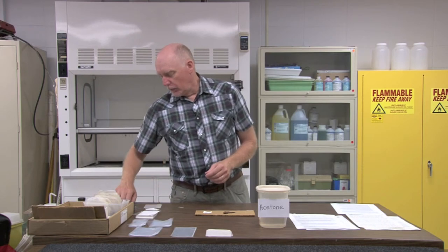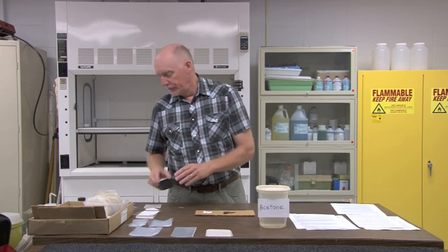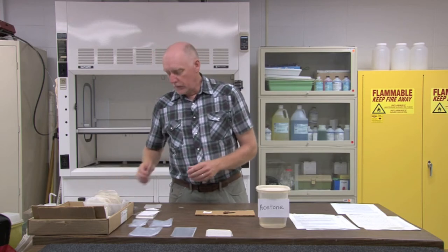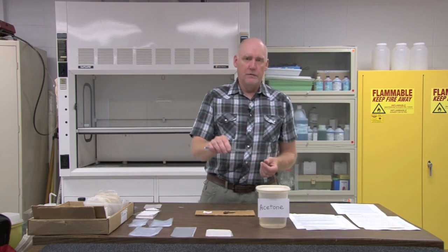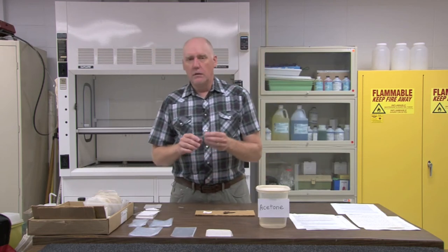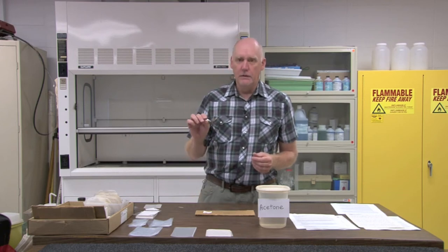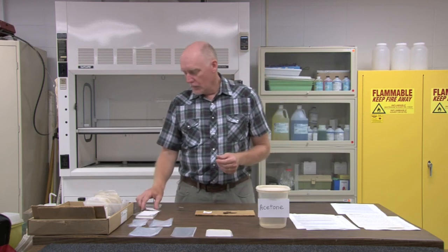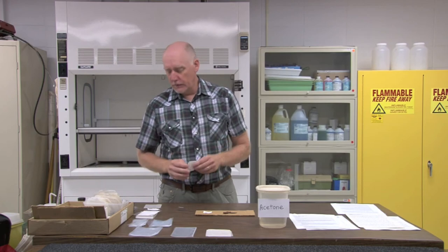I also use regular stainless paper clips for the field stage of the operation and for the acetone, and then for final preservation I use vinyl-covered paper clips. Some other tools you might find useful will be a large pair of forceps so that you can take specimens in and out of the acetone without getting it on your fingers, and some soft forceps, which are very valuable for picking up specimens gently without destroying them. You'll also need some small label paper to label your specimens in the field.